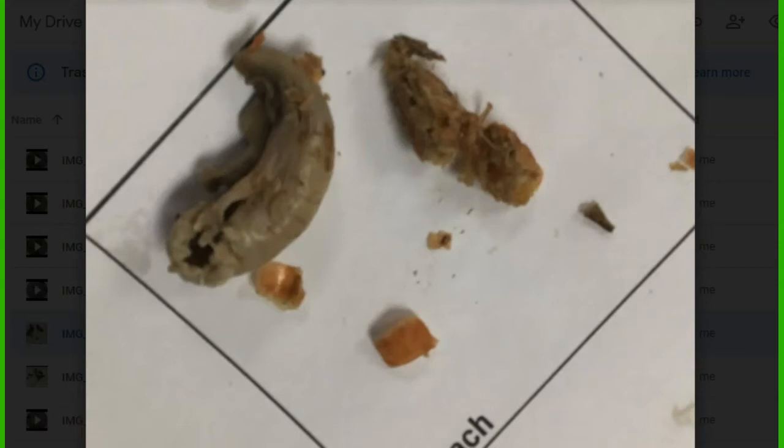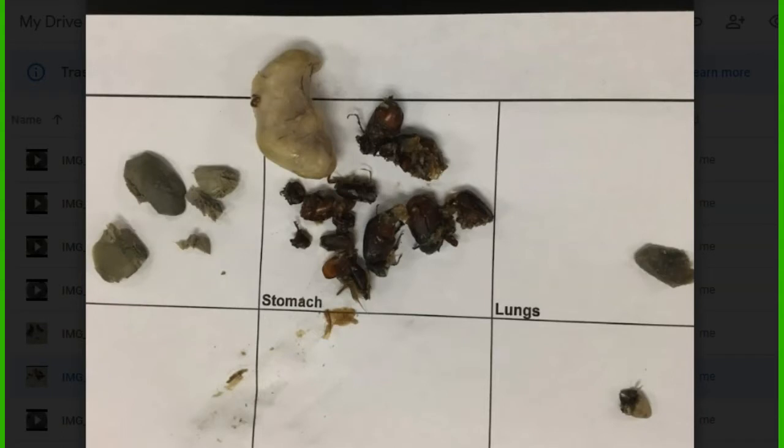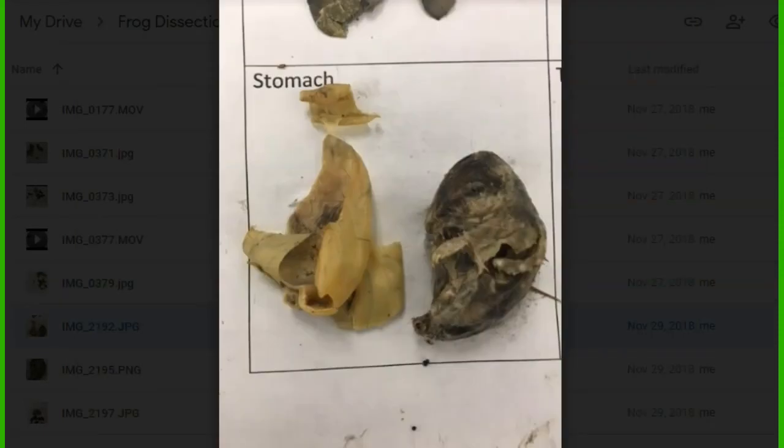This was what was left of a crayfish, crawdad, in the frog's stomach. Pretty rare. Only found one of those ever. Most of the time we find these kinds of beetles, June bugs, and you can see how that stomach is very stretched out, extended because it was full of those June bugs. Here's another one that I've only found one time, and this was a scorpion. You can see the tail there, and that was hidden amongst all these parts, and I couldn't tell what the parts were. The student was asking me about it, but I found that tail.